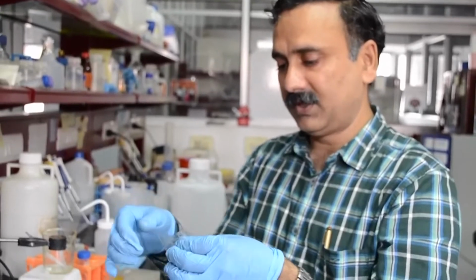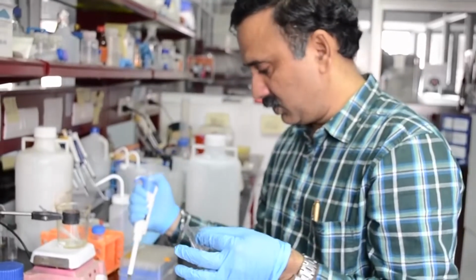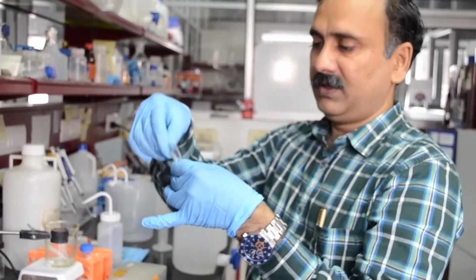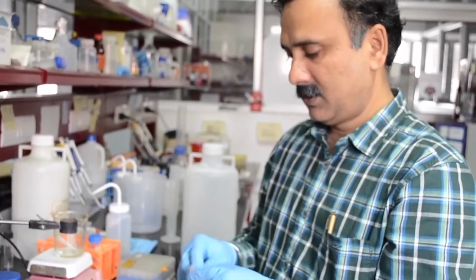Because if there is a leakage, the protein is going to come out from here instead of going via the electroelution. So you can just add 1 or 2 ml of your buffer, and that should be good enough. And then you can close it from the top as well with the next rubber band.